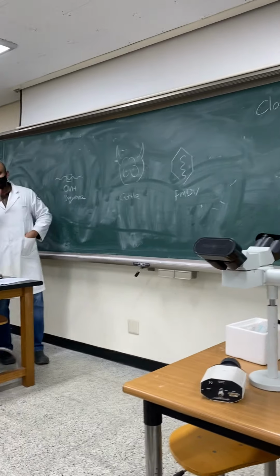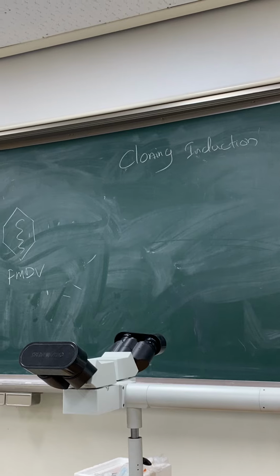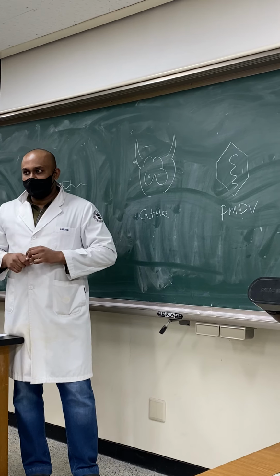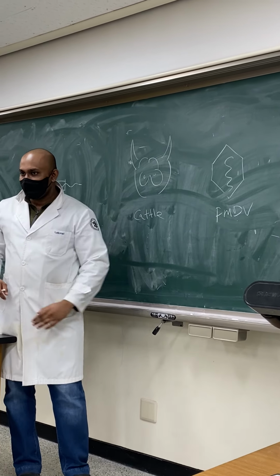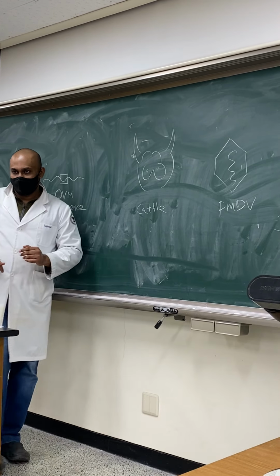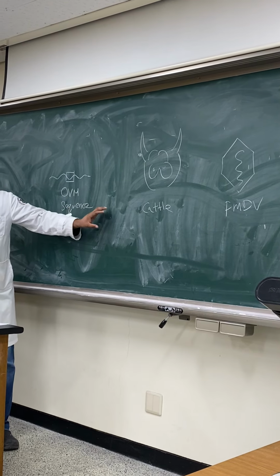So the next experiment that I am going to explain is cloning induction. This is somewhat a complicated multi-step experiment. As usual, I am not going to detail the entire protocol. Step by step, one by one, we can continue, right? So now I'm going to explain the theory.